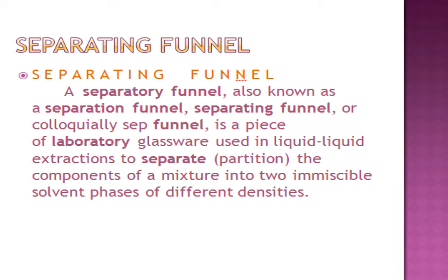A separatory funnel, also known as a separation funnel, separating funnel, or colloquially sep funnel, is a piece of laboratory glassware used in liquid-to-liquid extractions to separate, partition, the components of a mixture into two immiscible solvent phases of different densities.